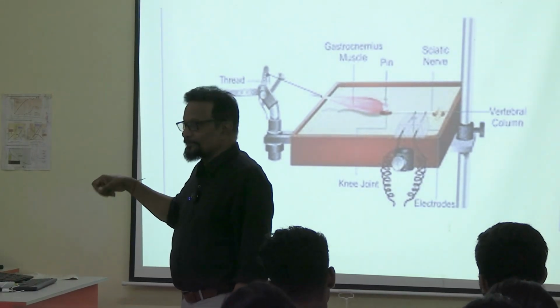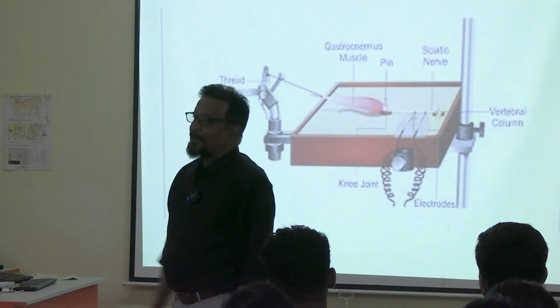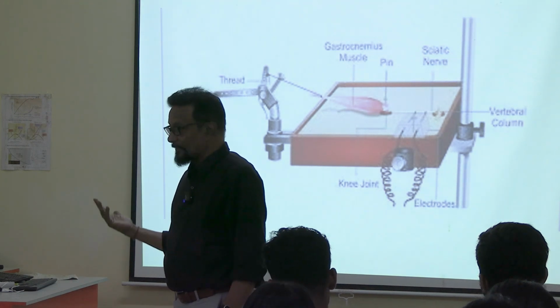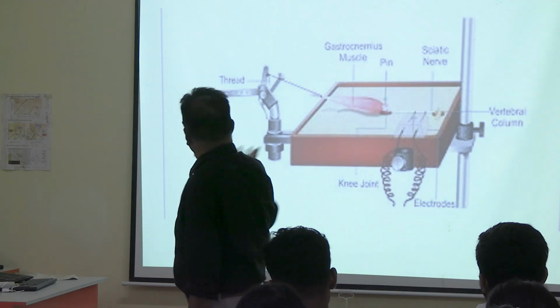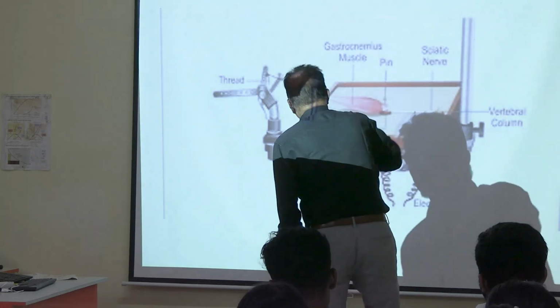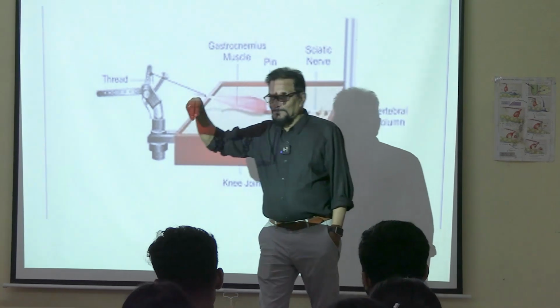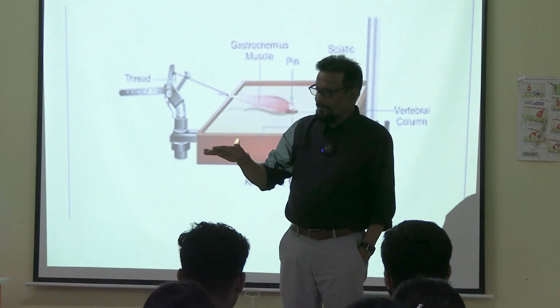You switch on, give one stimulus, and you get another curve. See what changes there are in the second curve. Then, after switching off the kymograph, you apply normal saline to bring the temperature down to normal.